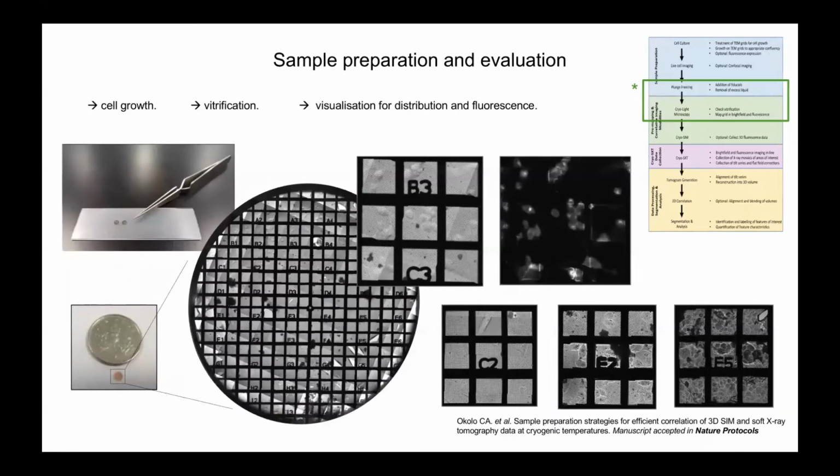And I will start. So what I'm going to do is highlight different sections of this as I'm showing you what we do at the beamline. I'm going to start with the plunge freezing because it's super important. One of the most crucial things is the preparation of samples. And for us, because it's cryoimaging, the vitrification process is very, very important. I'm showing here an autogrid. So this is a finder grid where you can see that each position is marked by a letter and number.